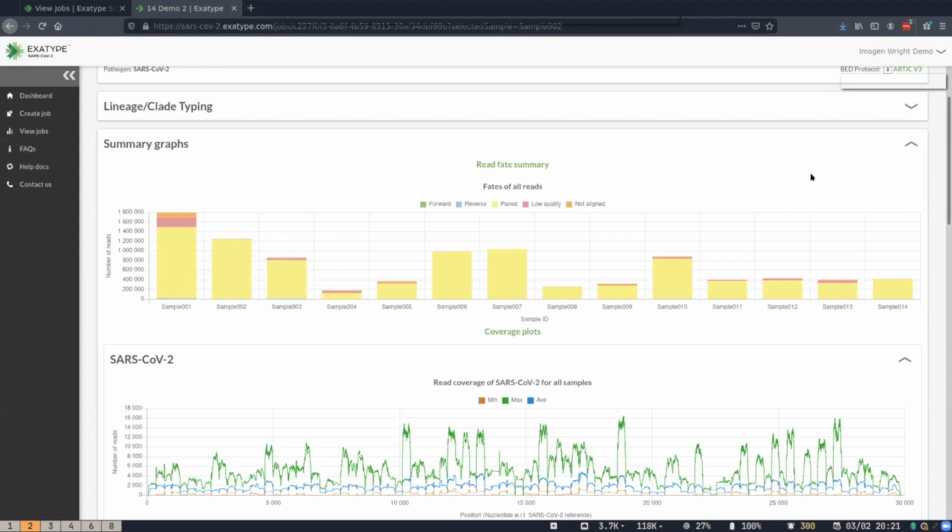So this is kind of a good way to say this is a pretty good sample run. The data is reasonably evenly distributed across the samples, and most of the data in the case of most samples did in fact map to the reference. So that's one first tick that we've done a reasonably good job of sequencing here.